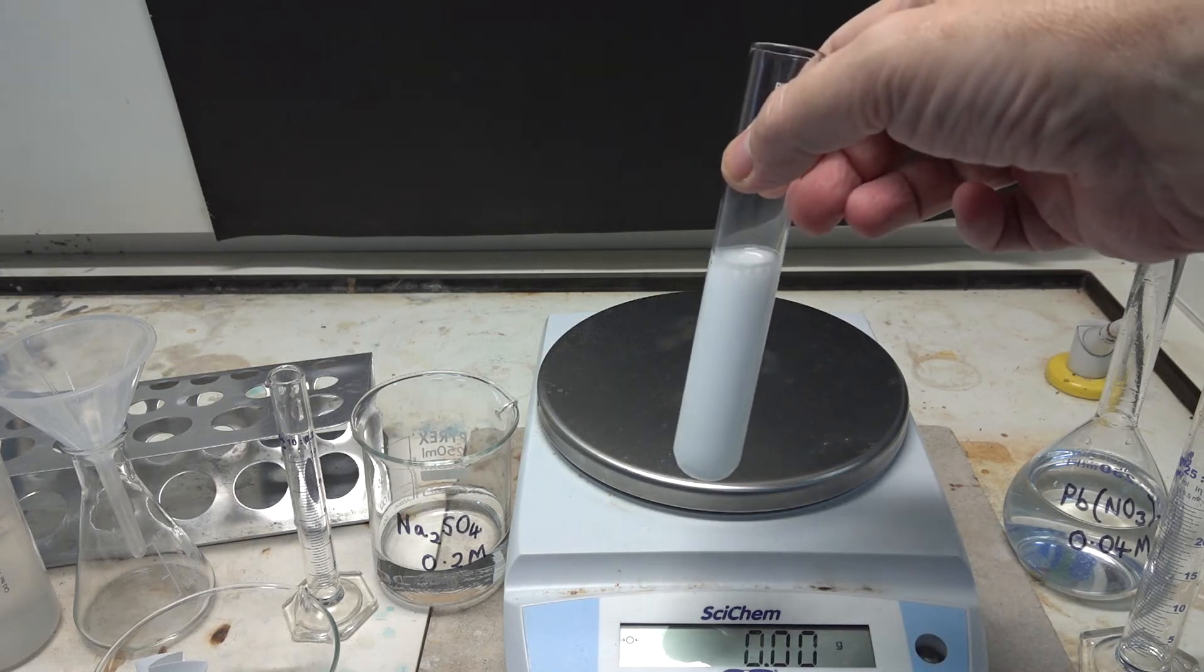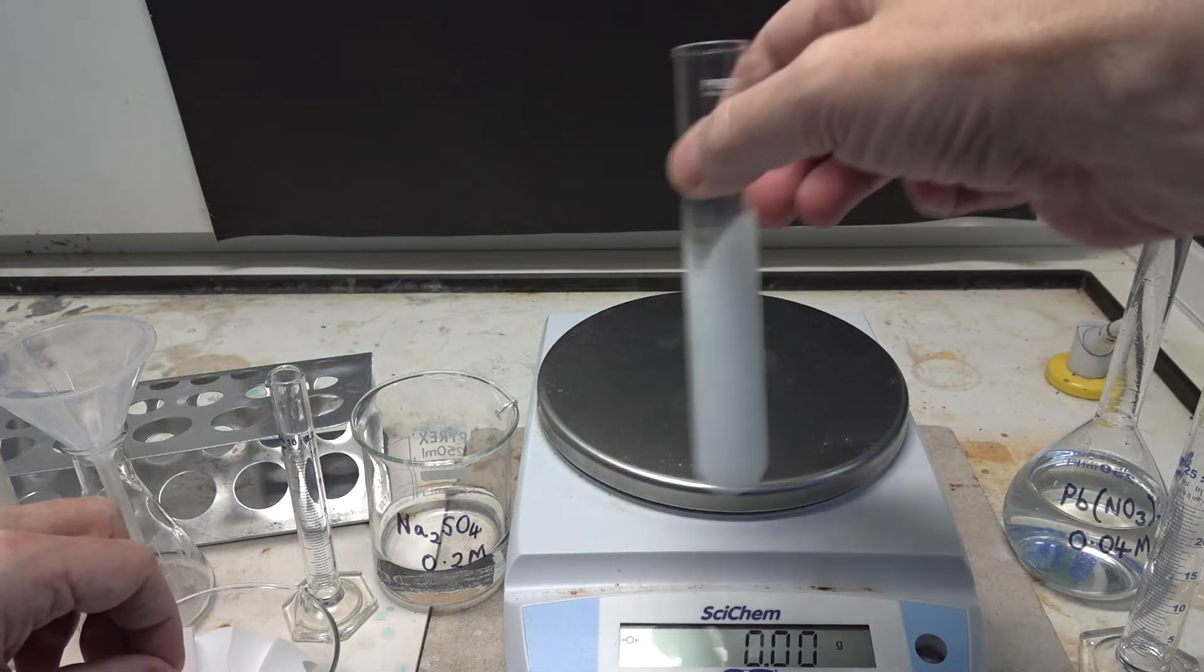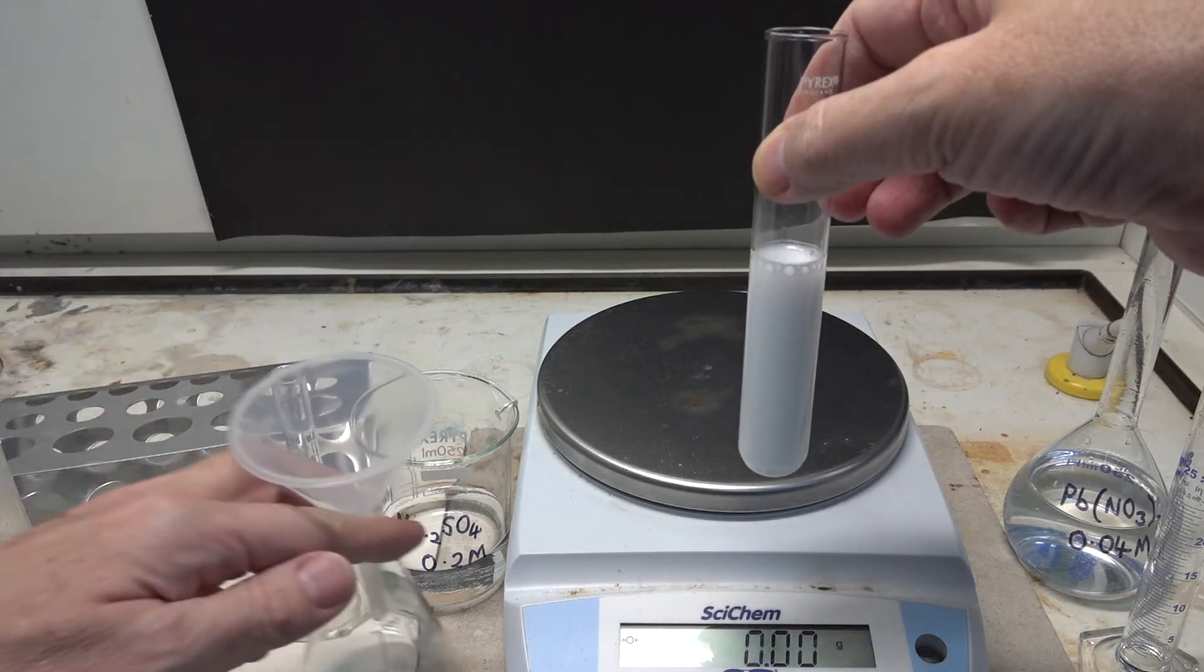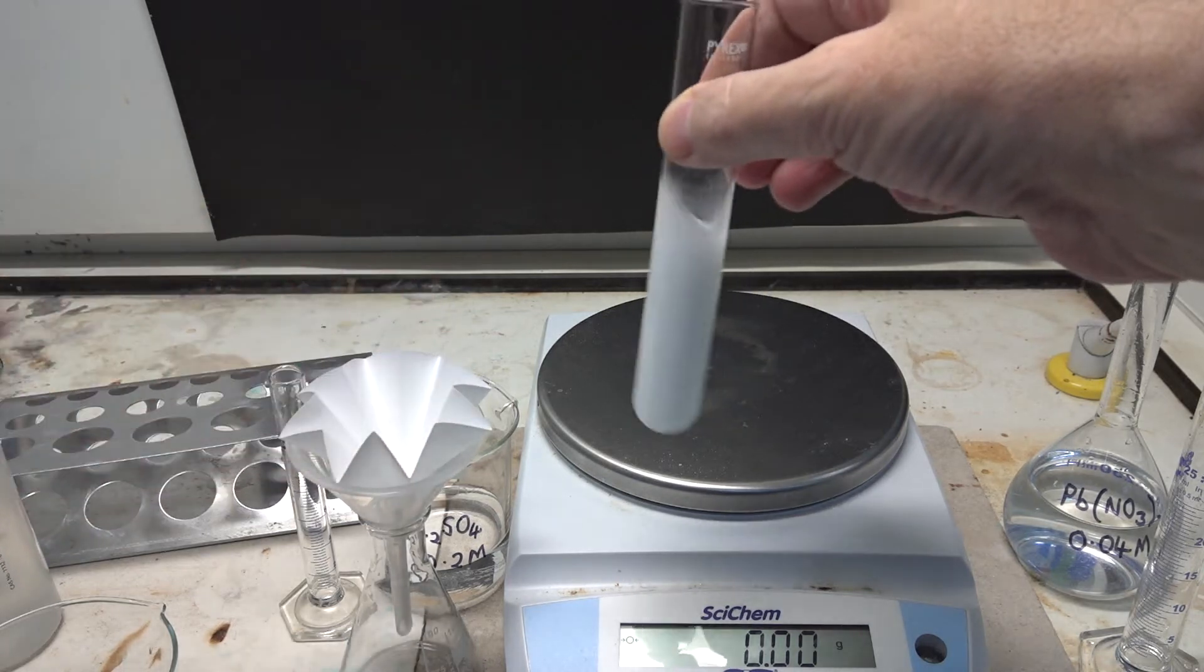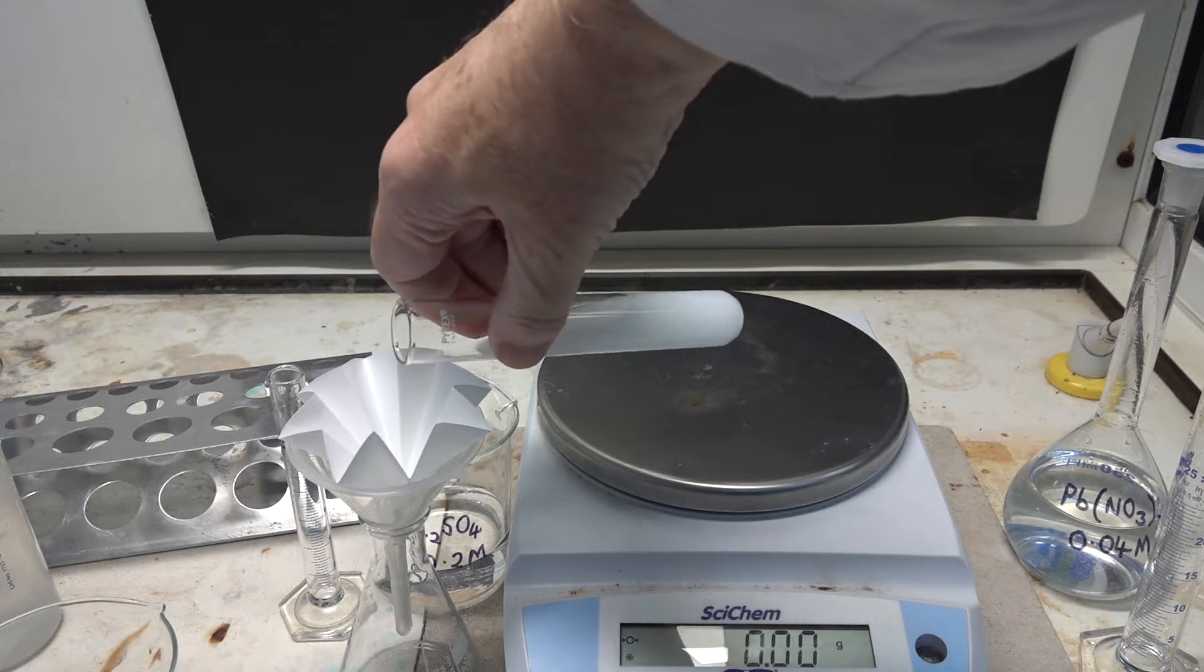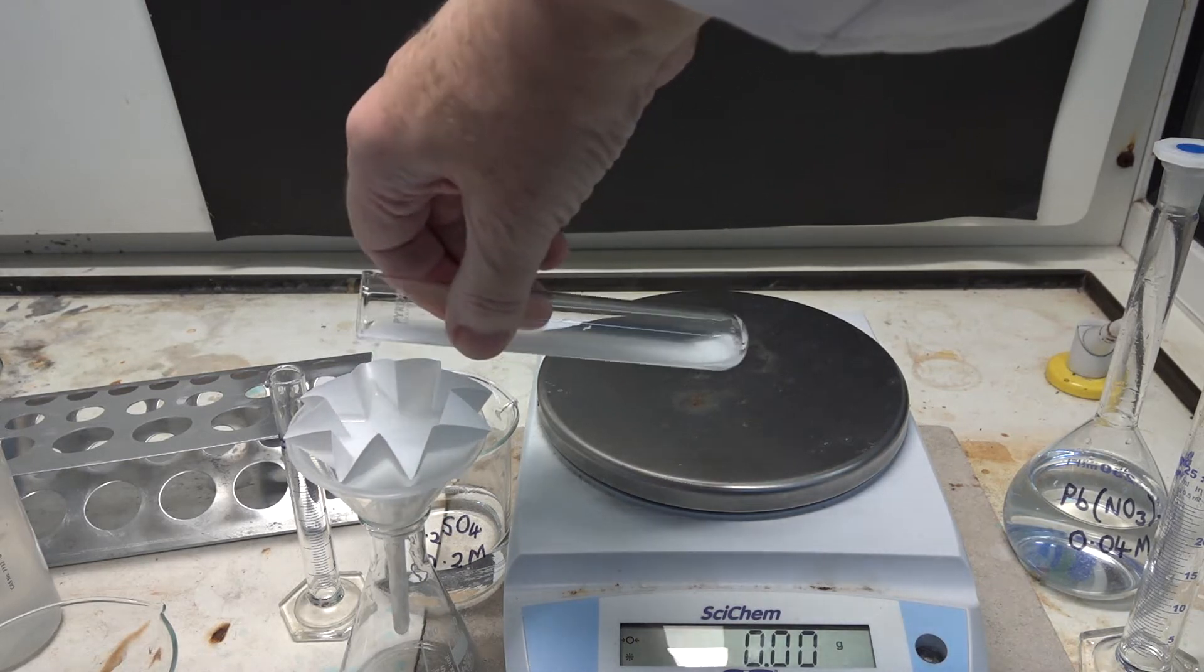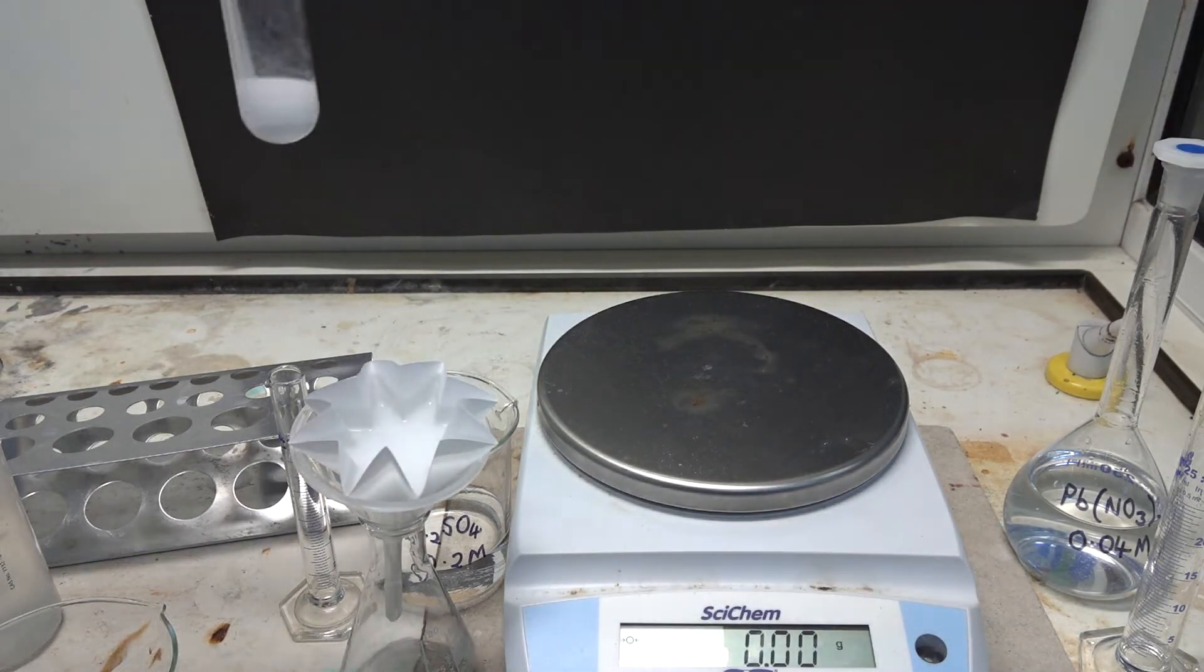And the next step in the experiment is to filter out the white precipitate. So we've got our funnel here and our conical flask. Into that we place the fluted filter paper, and we should be able to pour some of the reaction mixture into that. There it goes, it's the first batch.